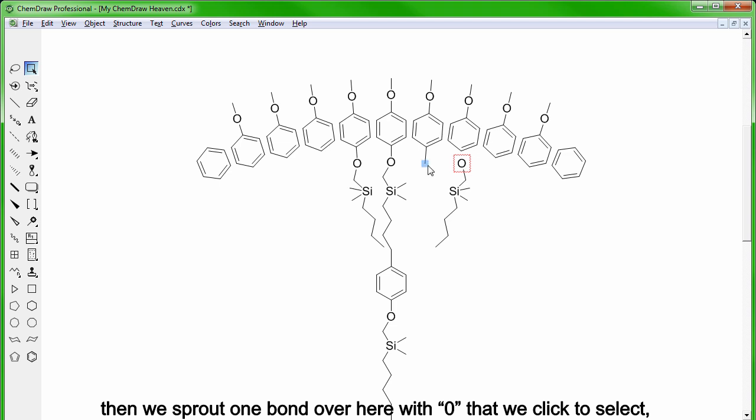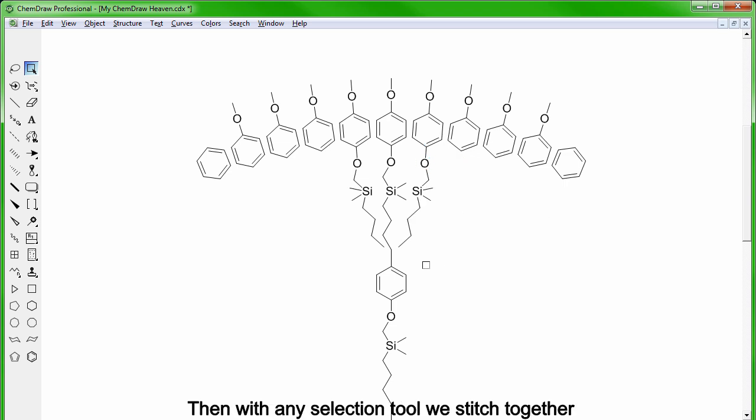Then we sprout one bond over here with 0 that we click to select, hold SHIFT, select the oxygen atom and hit CTRL-J again. Then with any selection tool we stitch together the different carbons to the benzylic carbon.